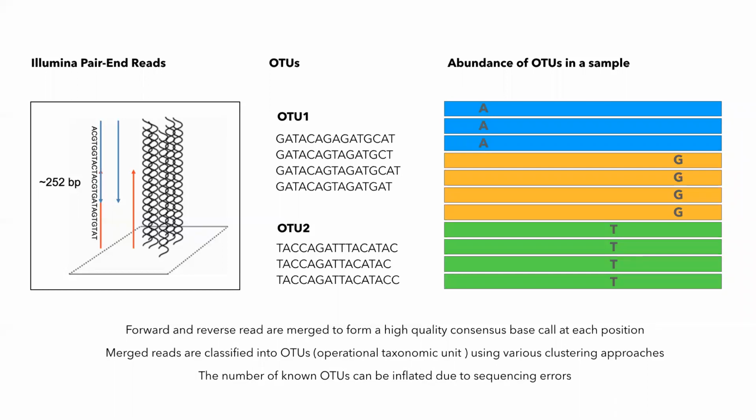And so, how do we get them? Well, what they represent are actually groups of closely related individuals, right? They don't represent an individual, they represent a group. And typically those groups are done using clustering. So for example, you can use hierarchical clustering to combine them together. And OTUs will be clusters of similar sequence variants of the 16S ribosomal DNA marker gene sequence.